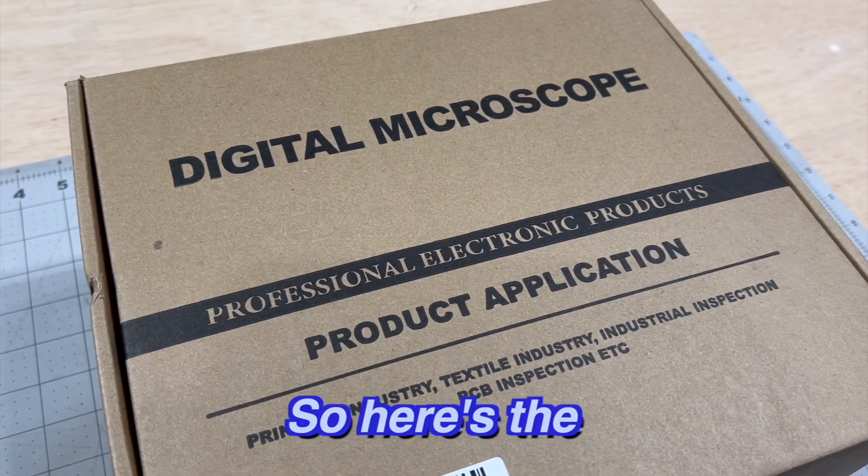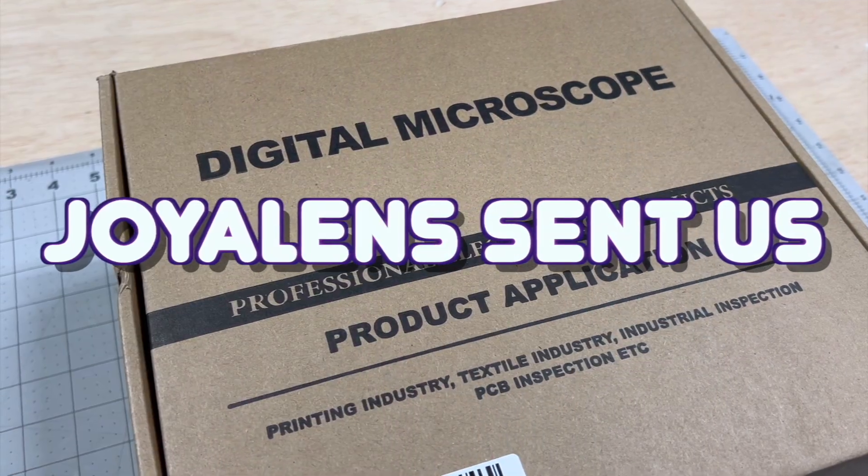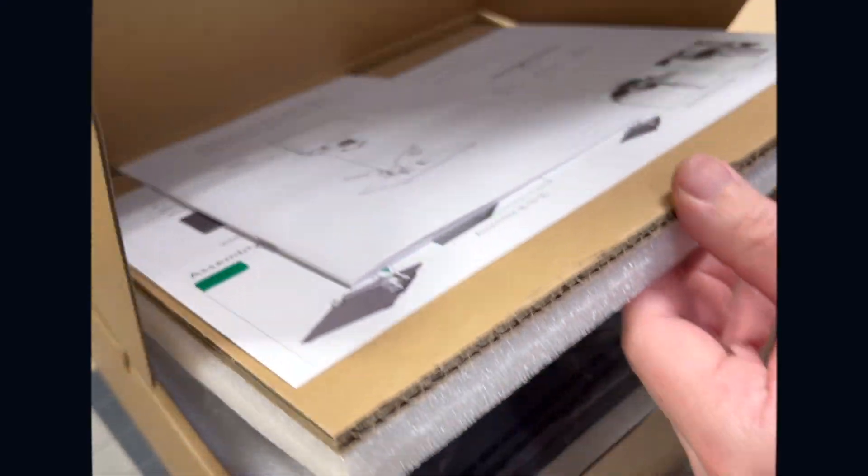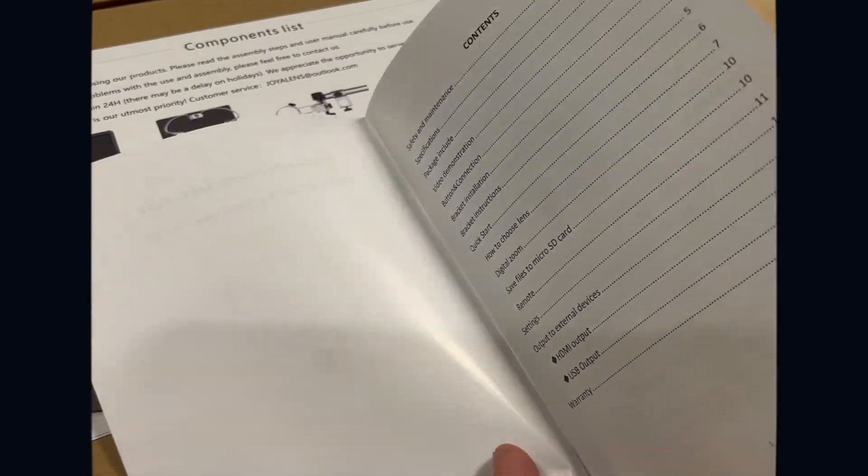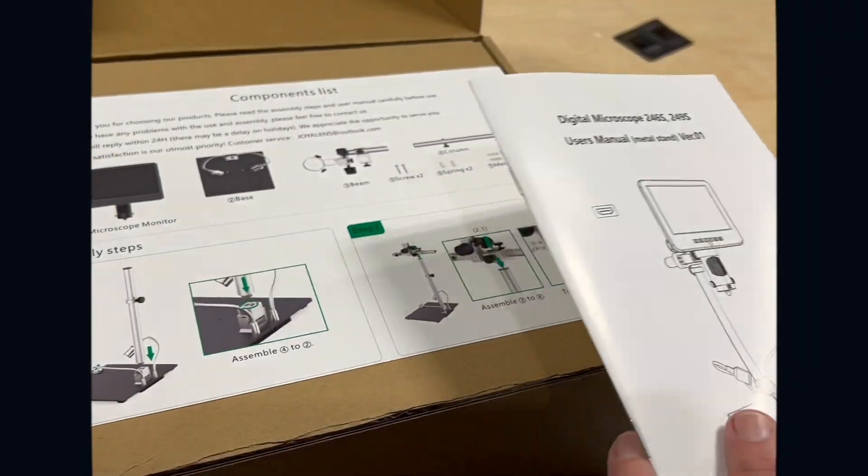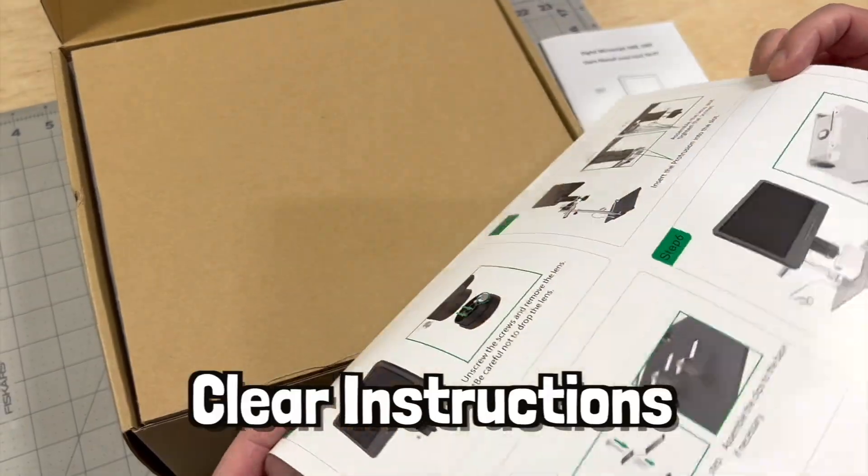All right, so here's the digital microscope that Joey Allen sent us. So let's get to unboxing. Looks like we got some clear instructions. That's nice.